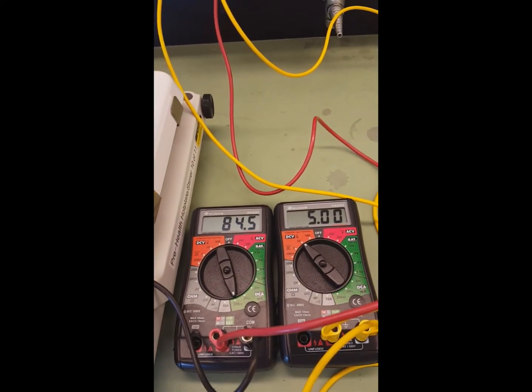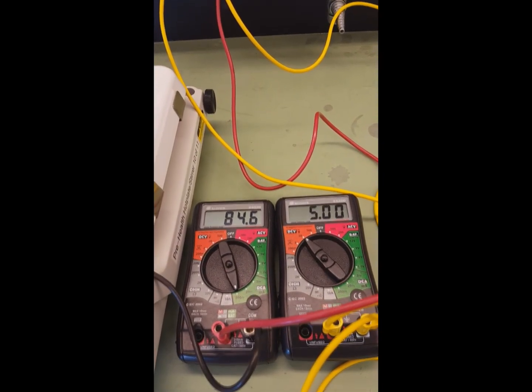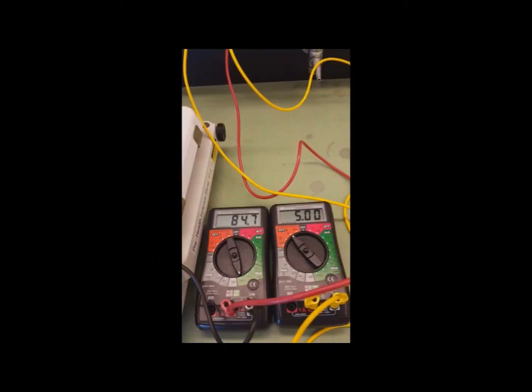You notice here the ammeter is set to the 0 to 200 milliamp position. I'm reading about 85 milliamps. There is a slight variation, and that's because the wire in the bottom of the burette is clustered a bit and is holding up some hydrogen. From time to time you see a little larger bubble being released. You'll see that as we go back to the video.